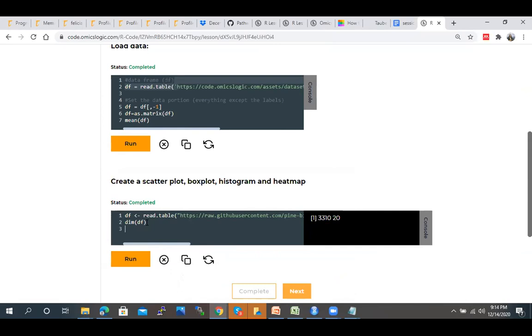Once we are able to load our file, next we can find the summary statistics. What are the summary statistics? Last time, if you remember, with which plot can we check summary statistics? Anybody remember which plot represents the summary statistics of data? Yes, box plot. So in R, apart from the box plot, the simple summary command will provide you the summary statistics of data.